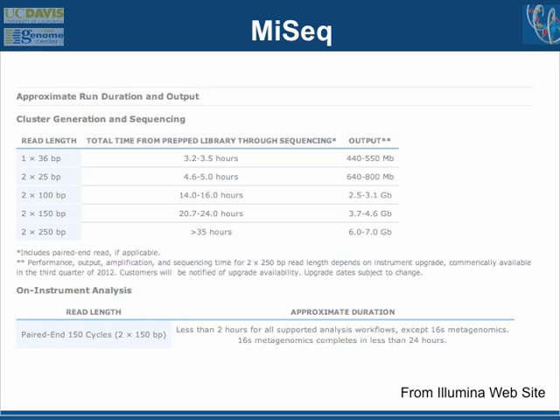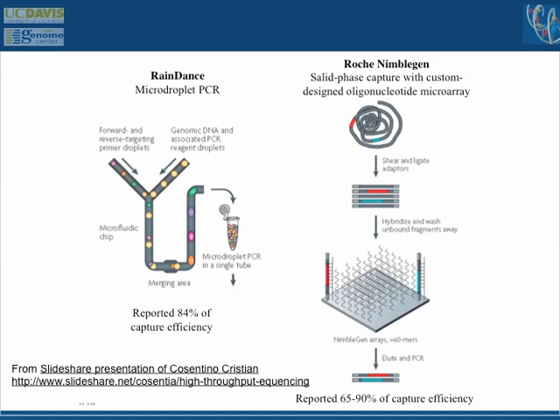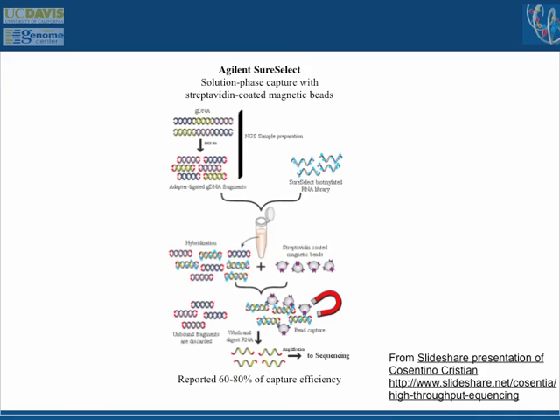You don't reuse them, you throw them away. Maybe some people try and use them, but we don't. Yeah? I think Mercedes is sort of asking about the genome reduction strategies that most people know as RADseq, which is just AFLPs, which is cheaper than doing whole genome because you can get thousands of homologous loci from hundreds of individuals in a single run.